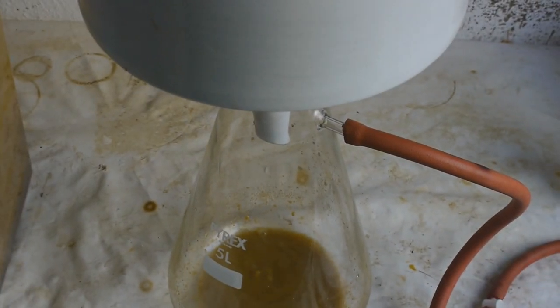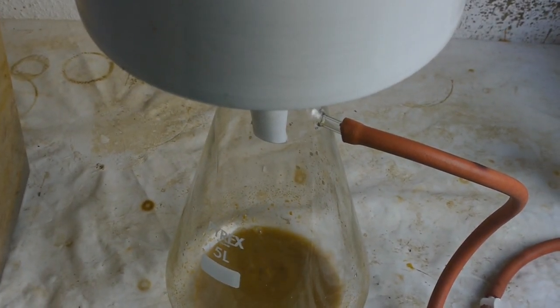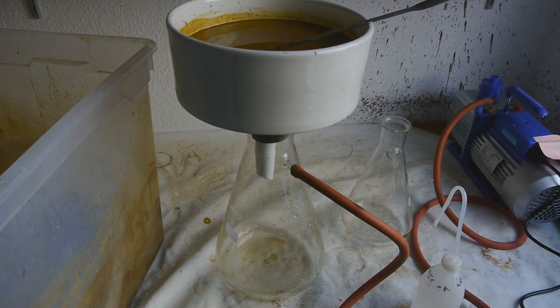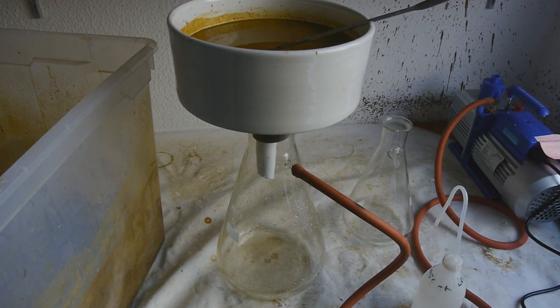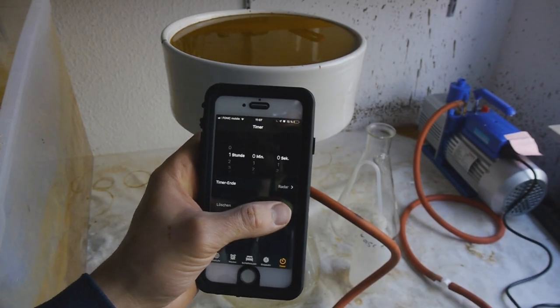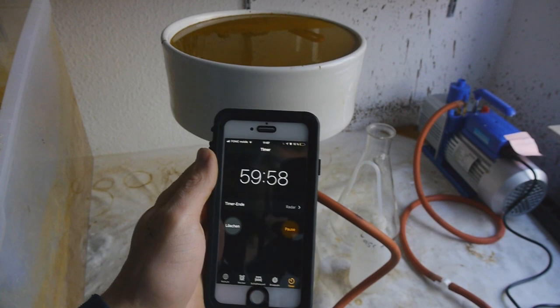Now there's at least clear water coming out from the other side, which is great. Okay, now this is working really nicely, but it's just taking a very long time. So this will have to filter for at least 3 hours. I've got most of the iron oxide in there now, so let's leave this running for exactly 1 hour and see how it looks then. For that I'll just start a timer and let's see what happens.